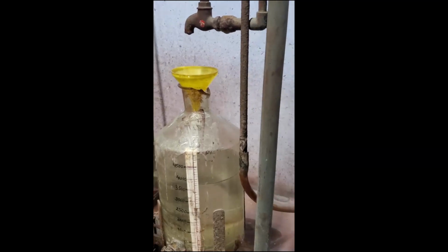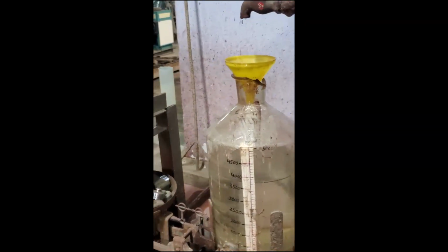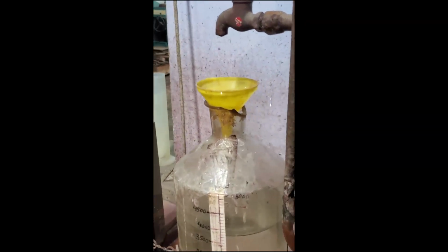Now we are filling the water drop by drop. So slowly we are applying the pressure on the pellet.